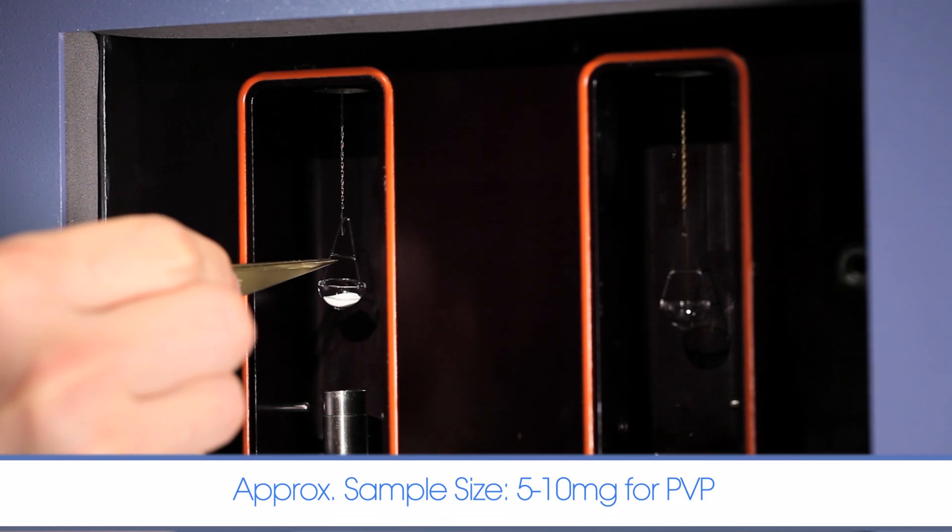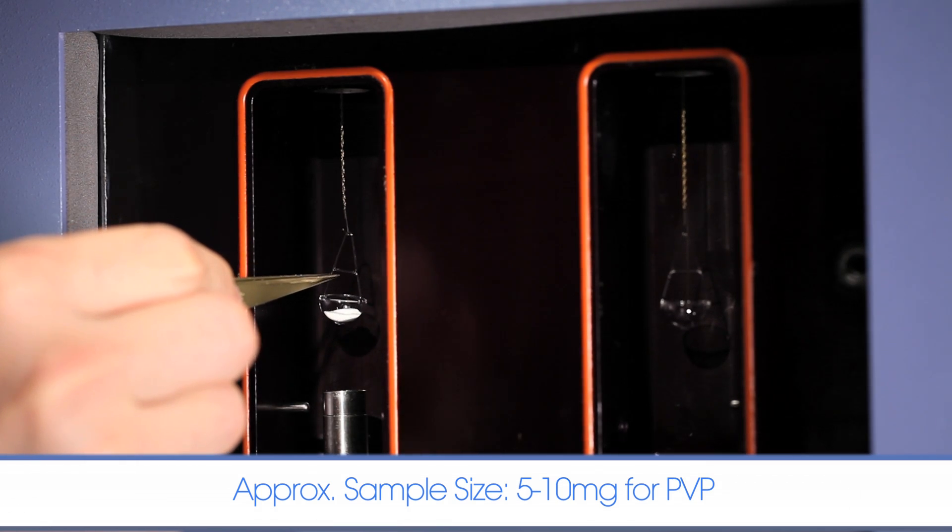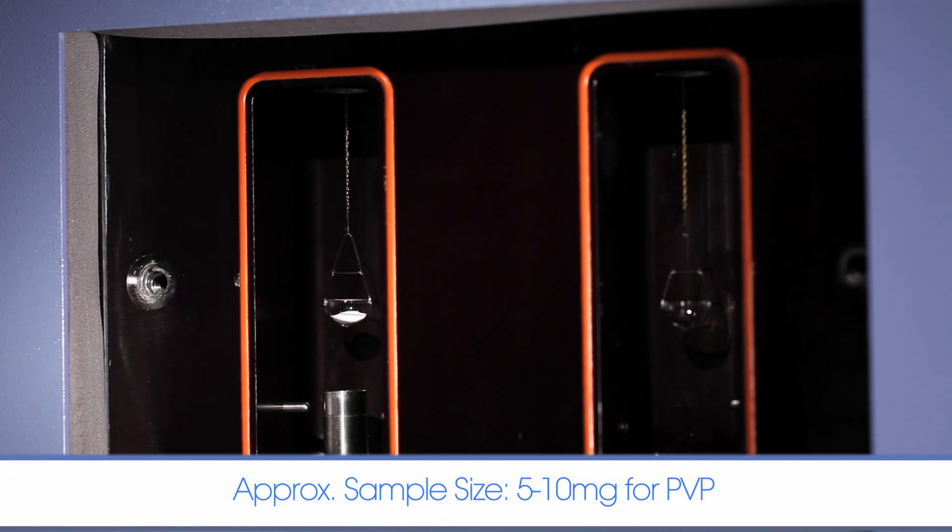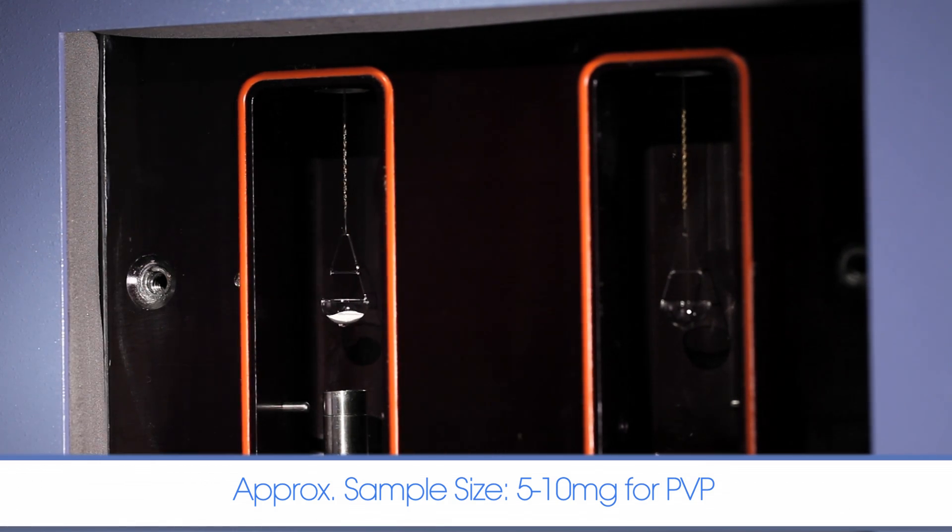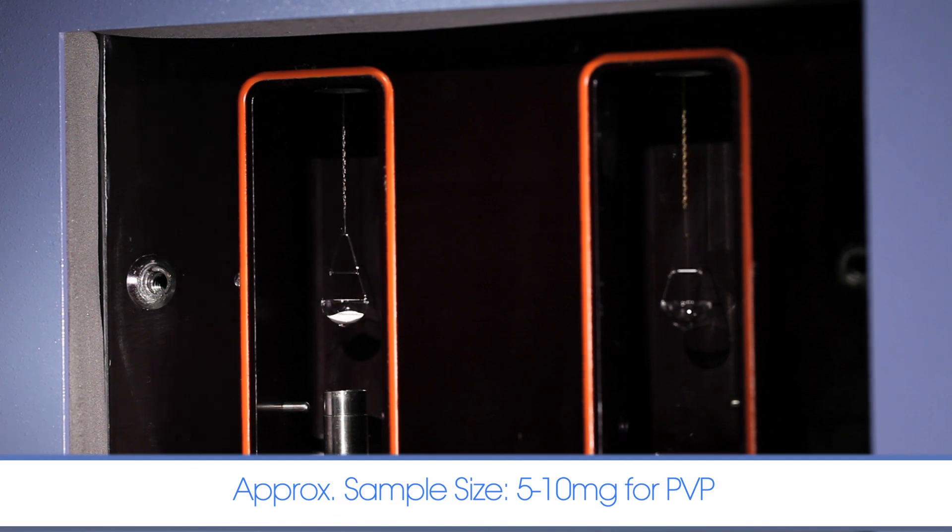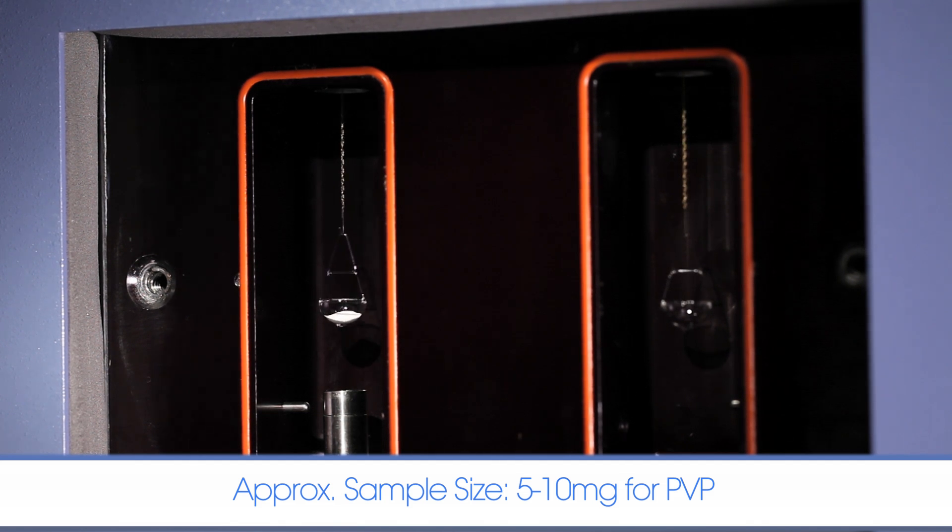If the sample is too small, it may not give enough sensitivity. Large samples may result in experiments running far too long.